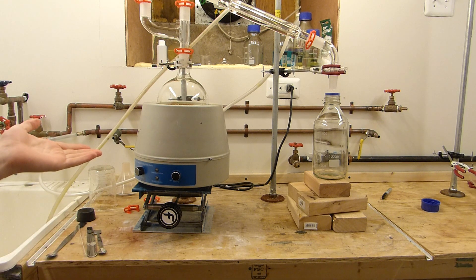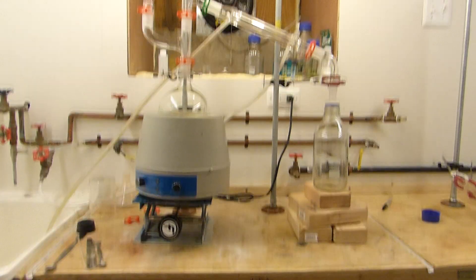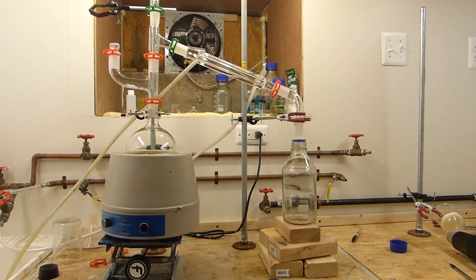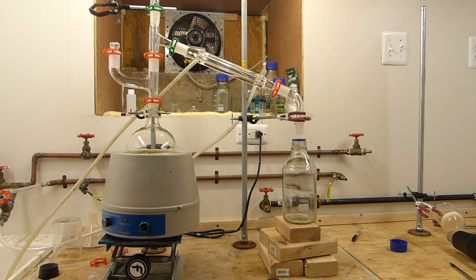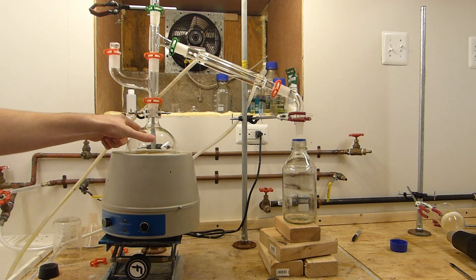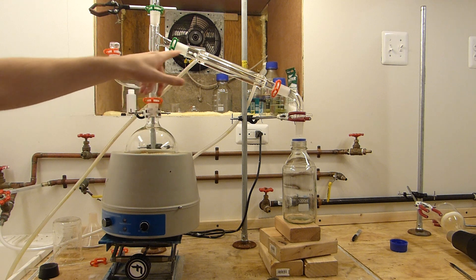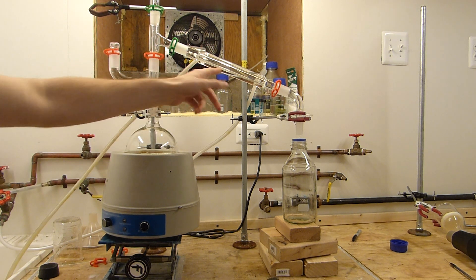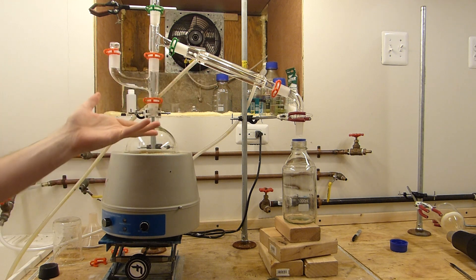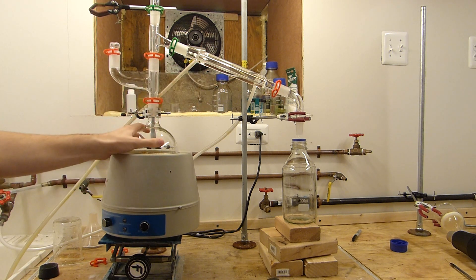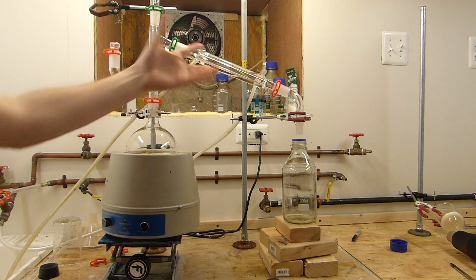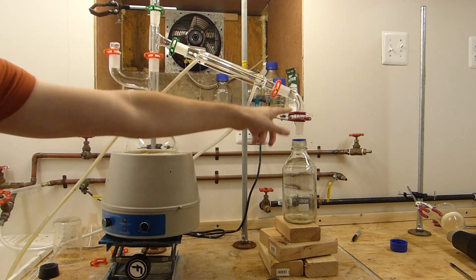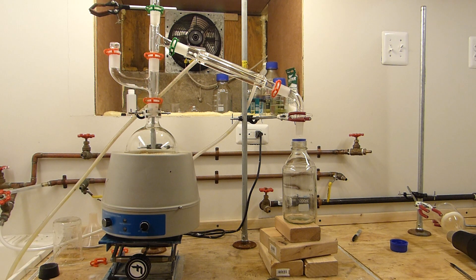So I've set up here for simple distillation, and this is pretty complicated for a simple distillation rig. Typically a distillation rig just has a boiling flask and then some sort of adapter that allows the boiling flask to be connected to a condenser. Of course the condenser is just a tube that has a water jacket around it which keeps it cool. So things boil, and then the vapor flows into the condenser where it condenses back into a liquid, and then this adapter here drips it into whatever your collection container happens to be.